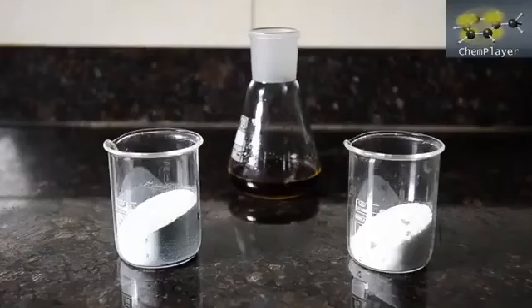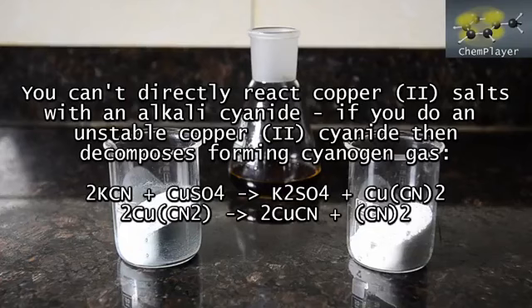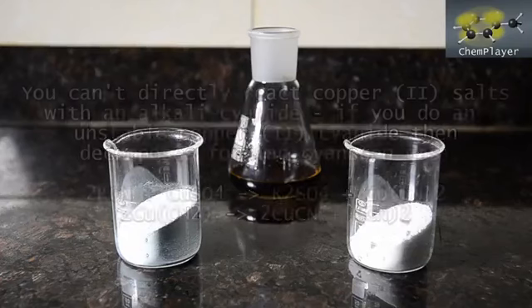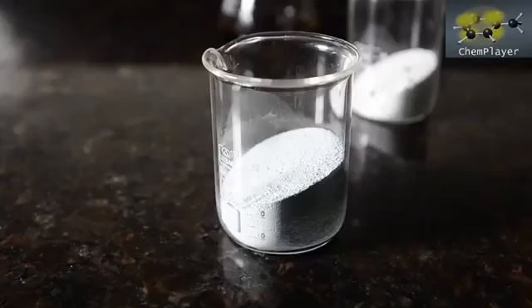The catch is that it's not as simple as adding copper sulfate to an alkali cyanide solution. If you do this, you get unstable copper 2 cyanide, which then decomposes forming deadly cyanogen gas. Not smart. So instead we do the reaction in the presence of a reducing agent, which ensures that the copper 1 cyanide is formed. So first up, here's our copper 2 sulfate.